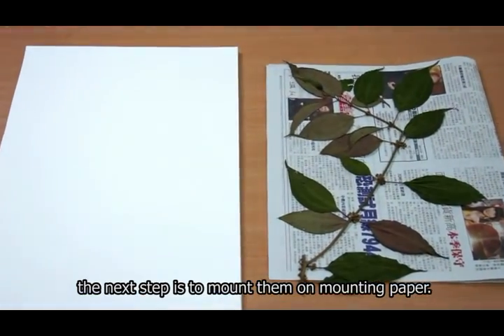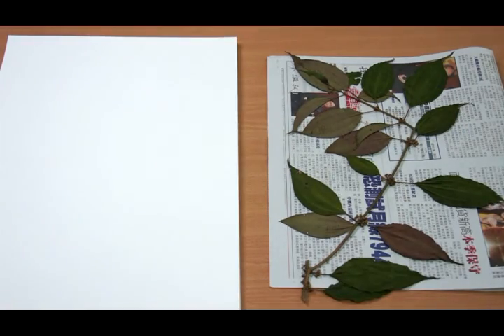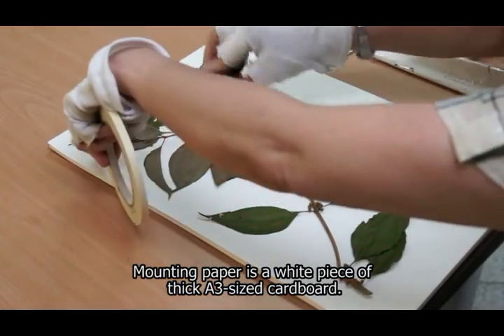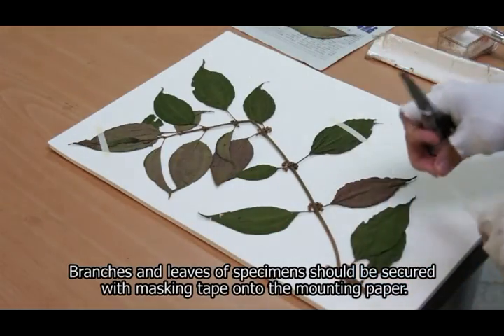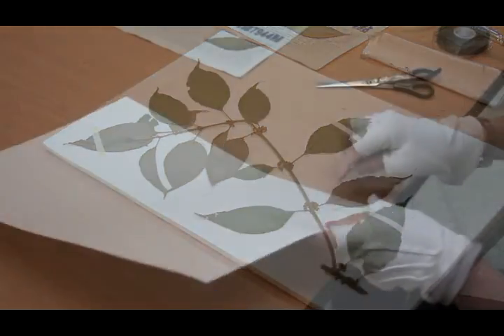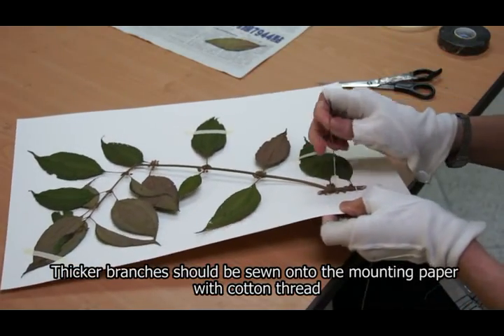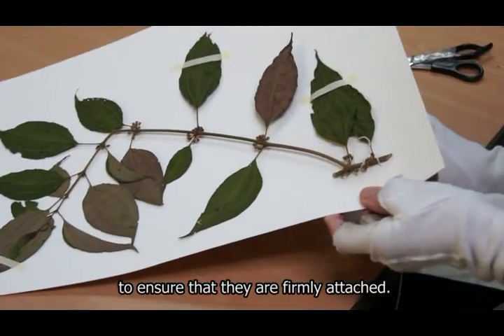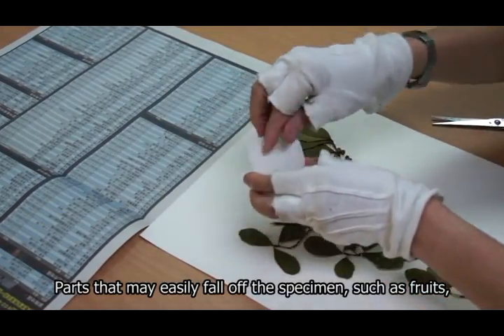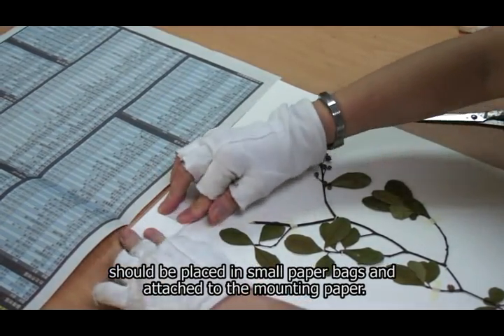After drying the specimens, the next step is to mount them on mounting paper. Mounting paper is a white piece of thick A3 sized cardboard. Branches and leaves of specimens should be secured with masking tape onto the mounting paper. Thicker branches should be sewn onto the mounting paper with cotton thread to ensure that they are firmly attached. Parts that may easily fall off the specimen, such as fruits, should be placed in small paper bags and attached to the mounting paper.